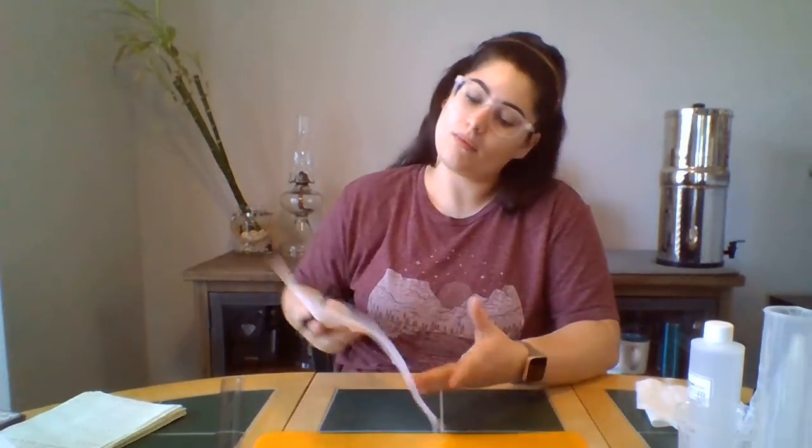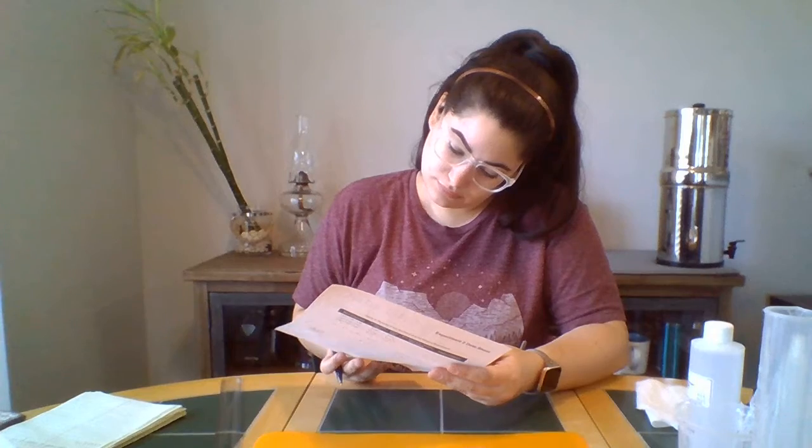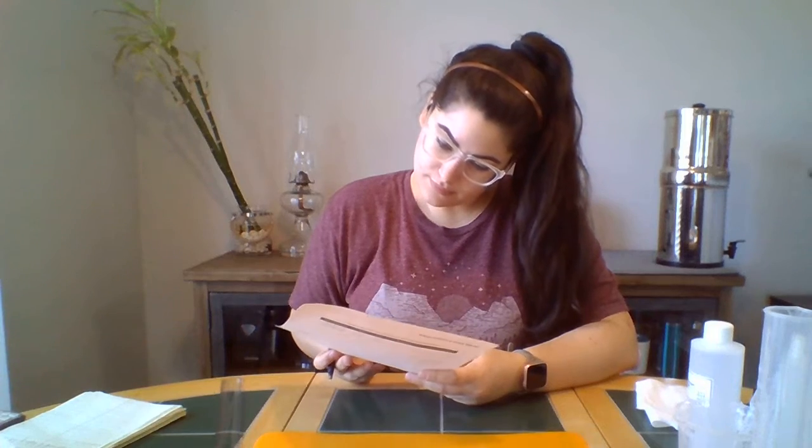And then for the rectangle, I guess that would be classified as a rectangle, maybe? I feel like I have to wipe my hands every time I touch those things. Okay, so that would be 1 centimeter times 2 centimeters times 2 centimeters. So that would just be 2 times 2 times 1, right? So volume equals 4 centimeters cubed.